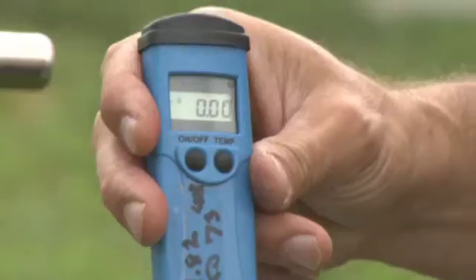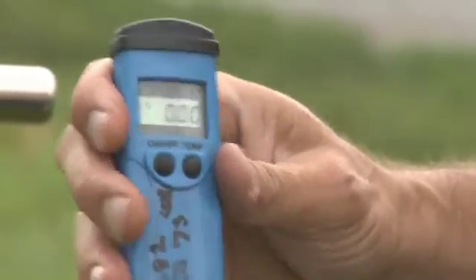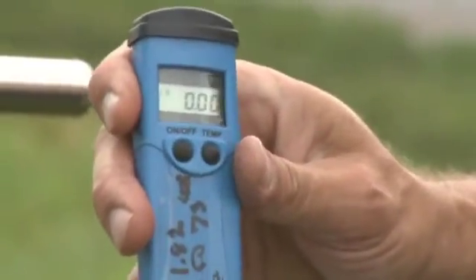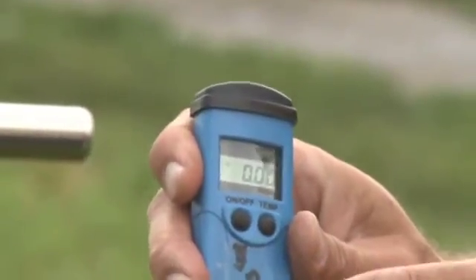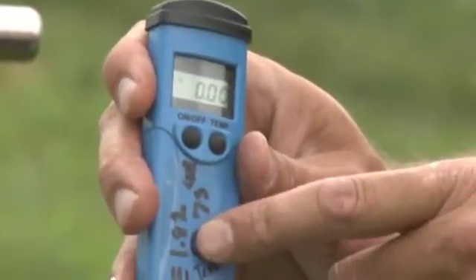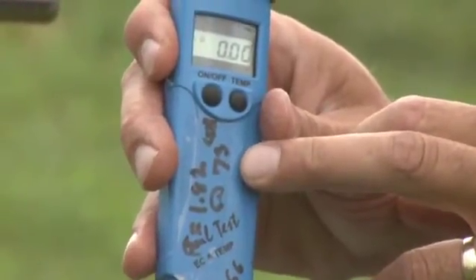And we simply, to turn it on, press the on button like that and it should read as zero. And on the front of the probe, you'll see that it's got an R value, which is a resistivity measure of 1.82 at 73 degrees Fahrenheit.